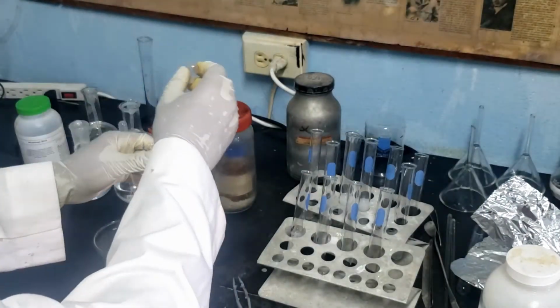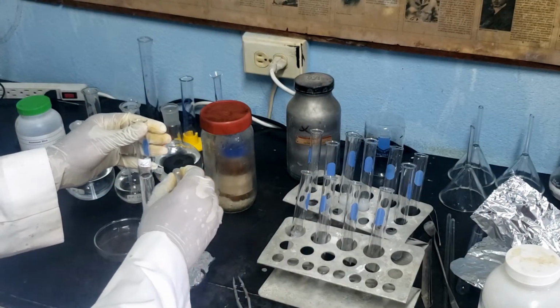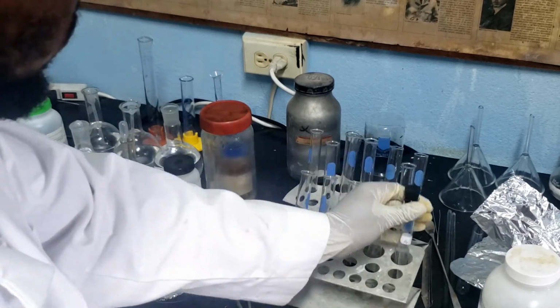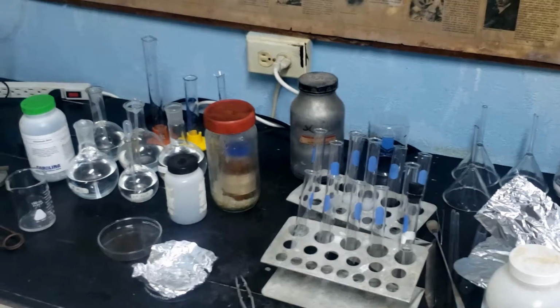By reacting aluminum with mercury chloride, we can once again see what happens when that amalgam is formed.